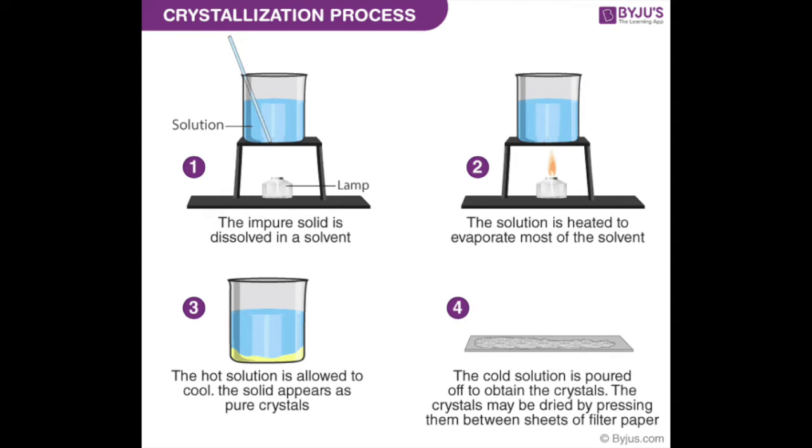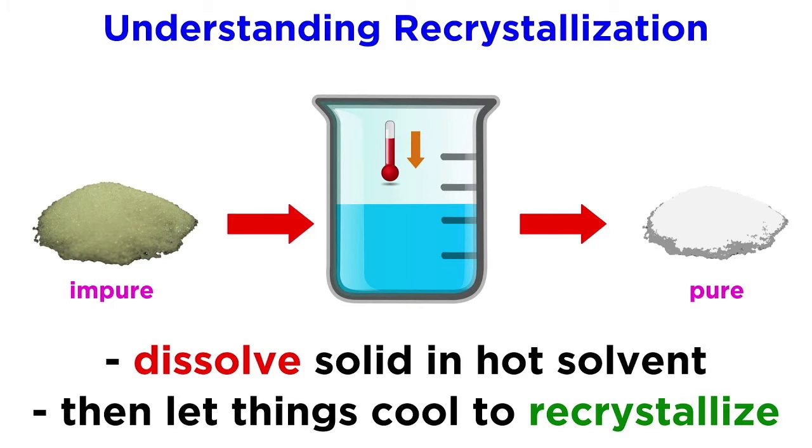Even though crystallization and recrystallization processes are really alike, they are different. Crystallization refers to the formation of a new insoluble product by a chemical reaction. Typically, crystallization is a method used to obtain the crude product. Recrystallization does not involve a chemical reaction. The crude product is simply taken into solution, and then the conditions are changed so crystals can reform. This produces a much purer product. Recrystallization is not generally thought of as a separation technique. Rather, it is a purification technique in which a small amount of an impurity is removed from a compound.